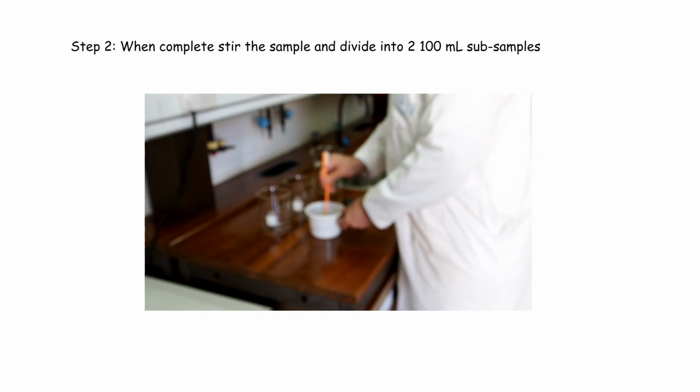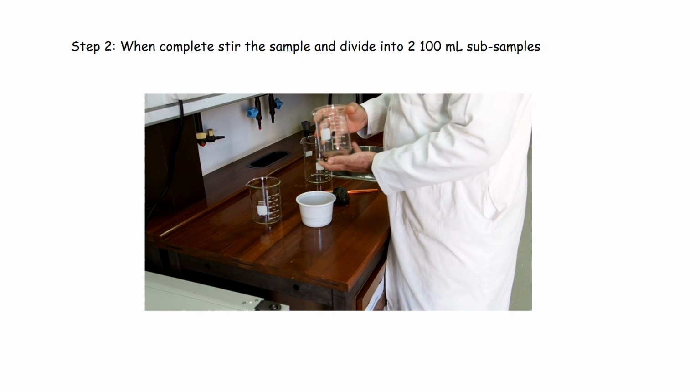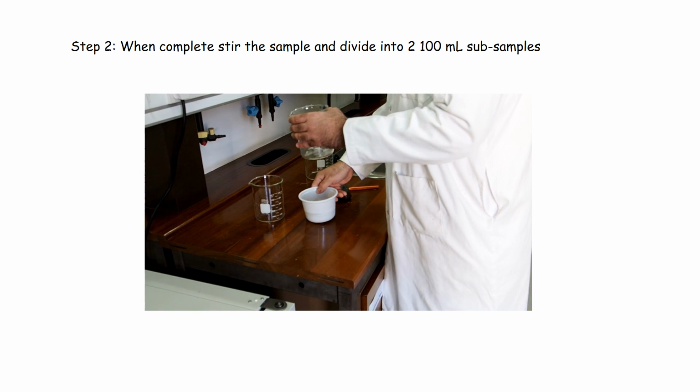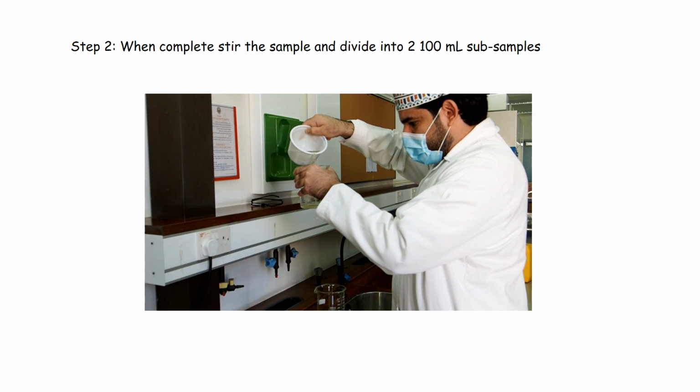When you have completely removed all of the material from the sample, divide it into two 100 ml subsamples.